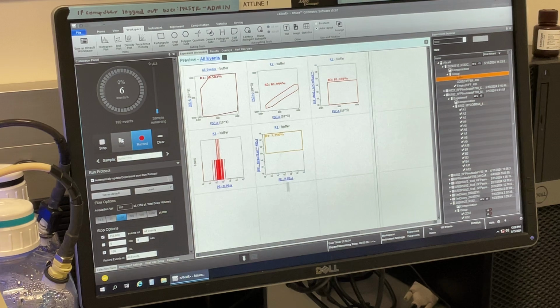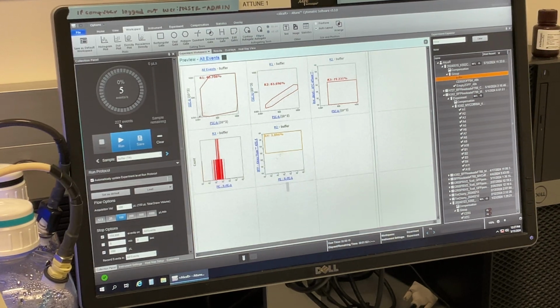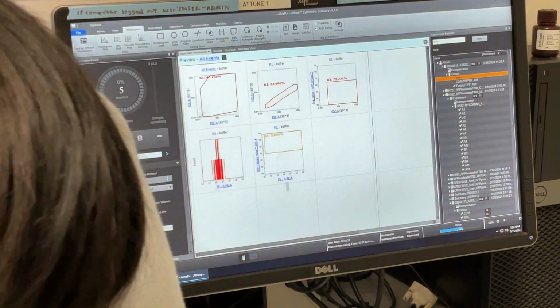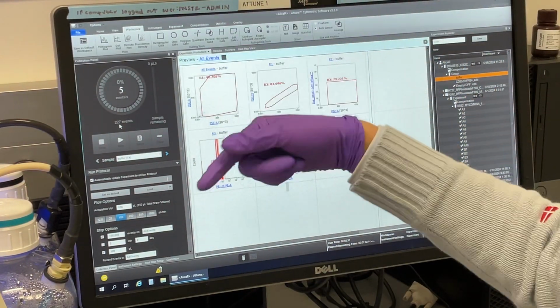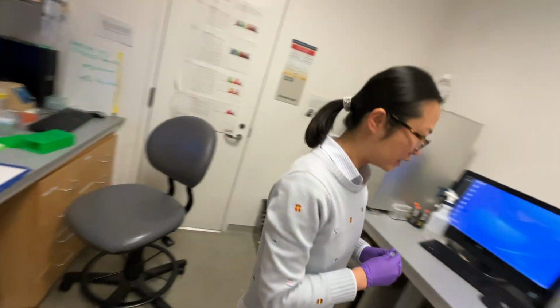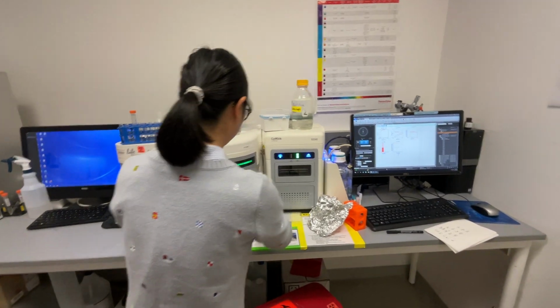What does the number identify? The change in numbers, is it the amount of cells? The events are the cells per second being registered, so it's only counting around 200 events, meaning 200 cells or debris in there. But we think that it's clean enough. This is just some of the cells or debris still going through the tubing. And then what is this? So this is the one edited with CD55.